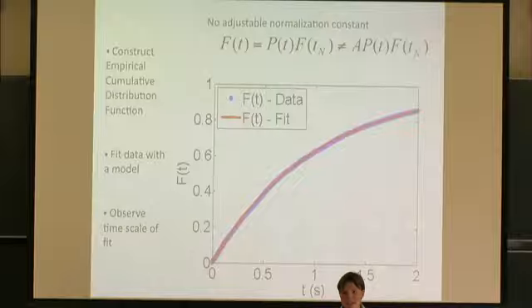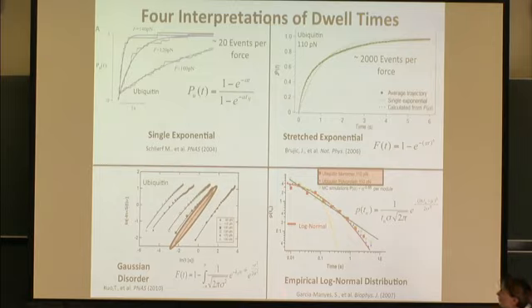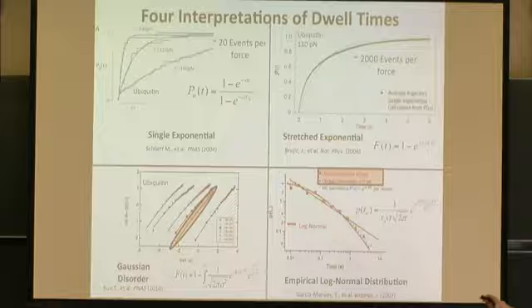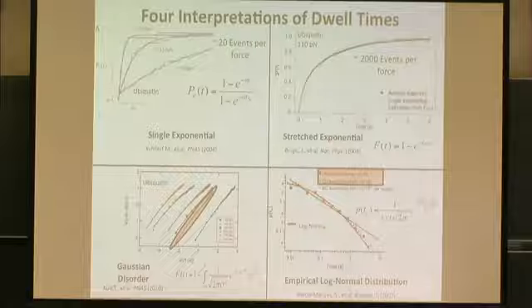Now this is where politics in science plays a big role, and I want to show you something funny. If you look through the data from 2004, the first fit of the kind of data that I showed you is a single exponential fit, but admittedly there are very few data points, and that's why these trajectories look very staircase-like even in the cumulative distribution. Then you increase the statistics to thousands of data points, and what you see is that the single exponential essentially fits through one point on your cumulative distribution. Something else is clearly going on.